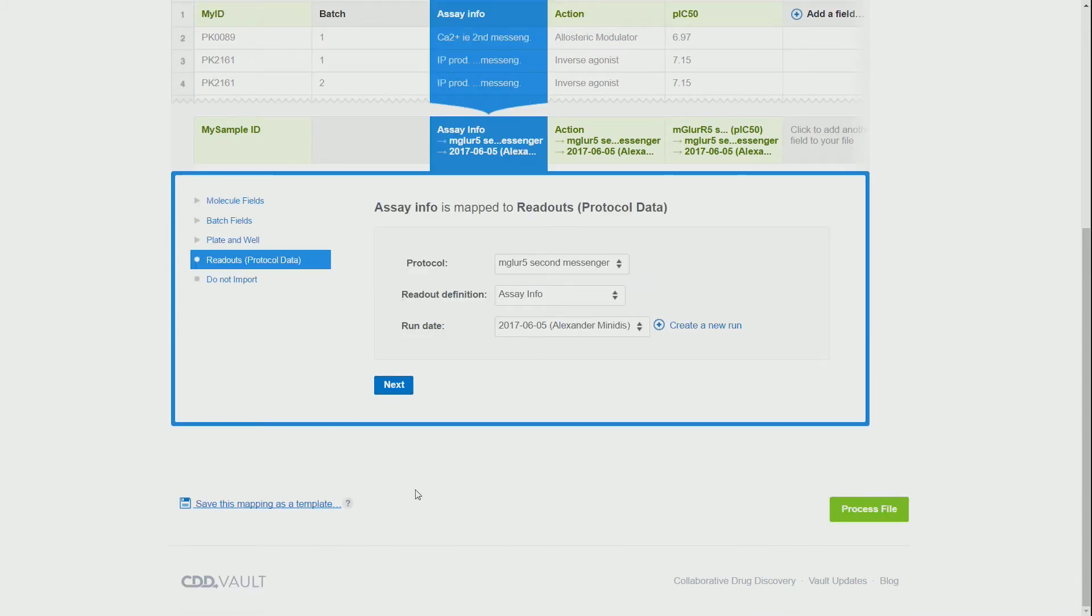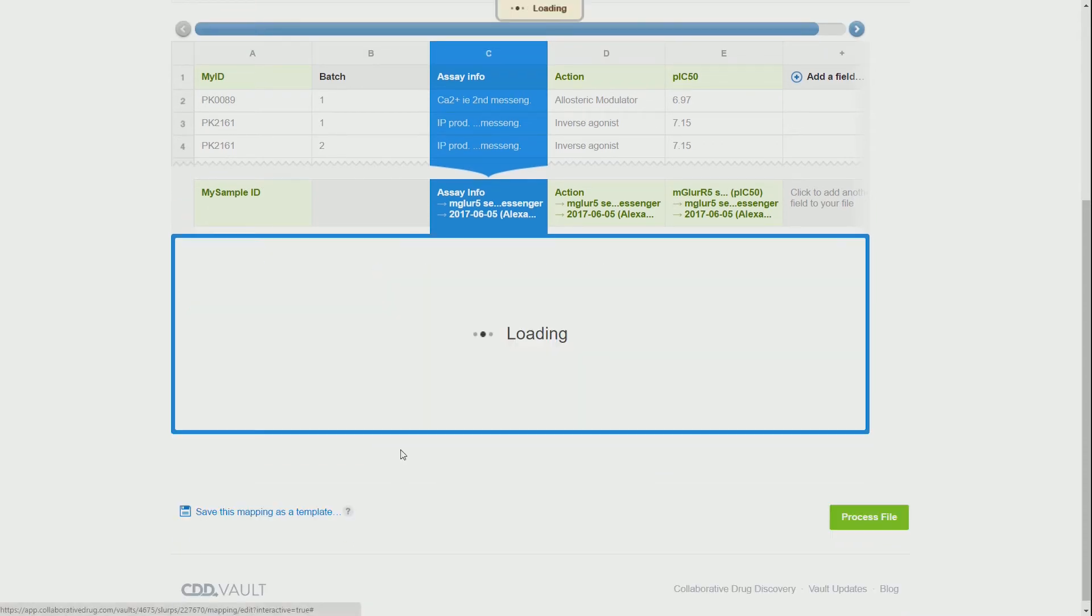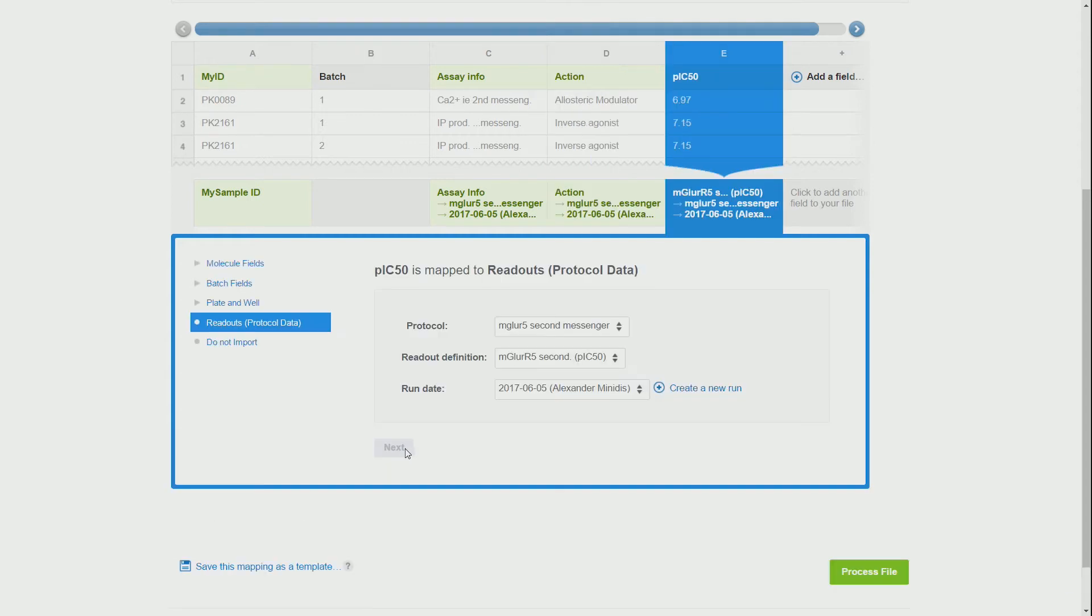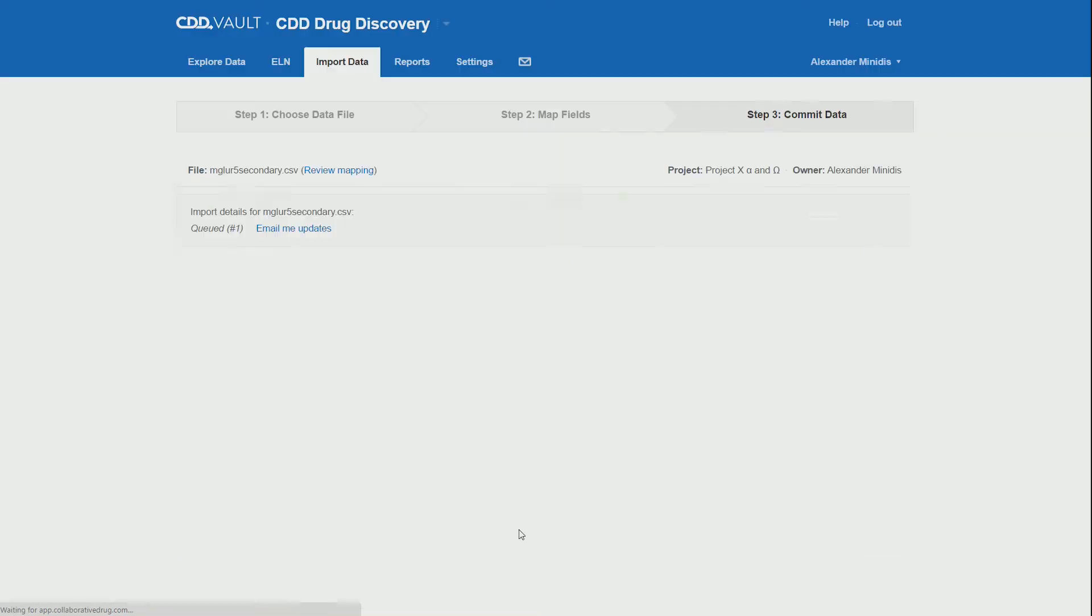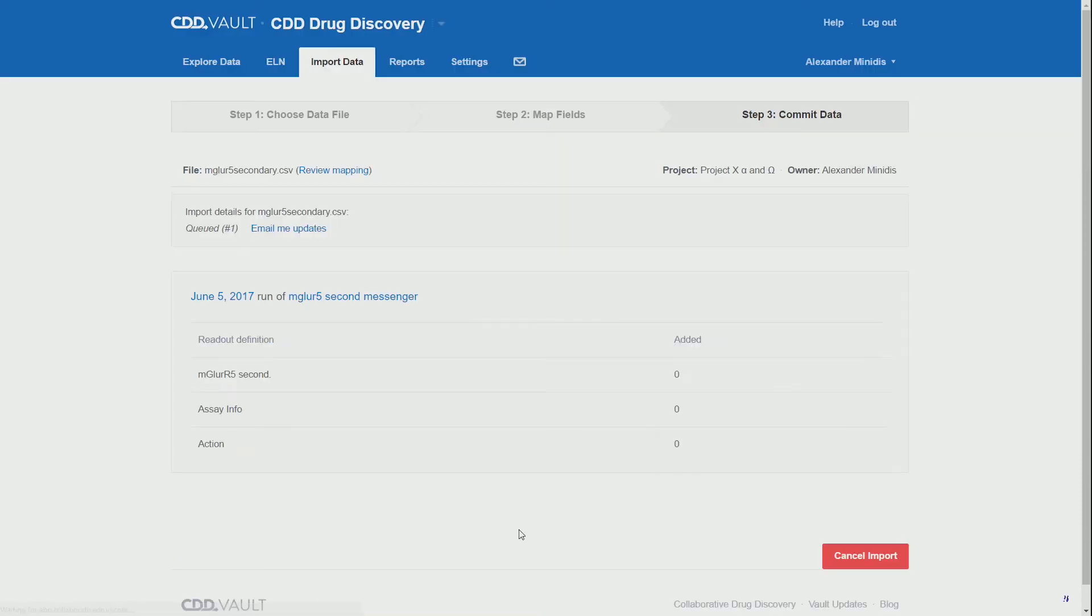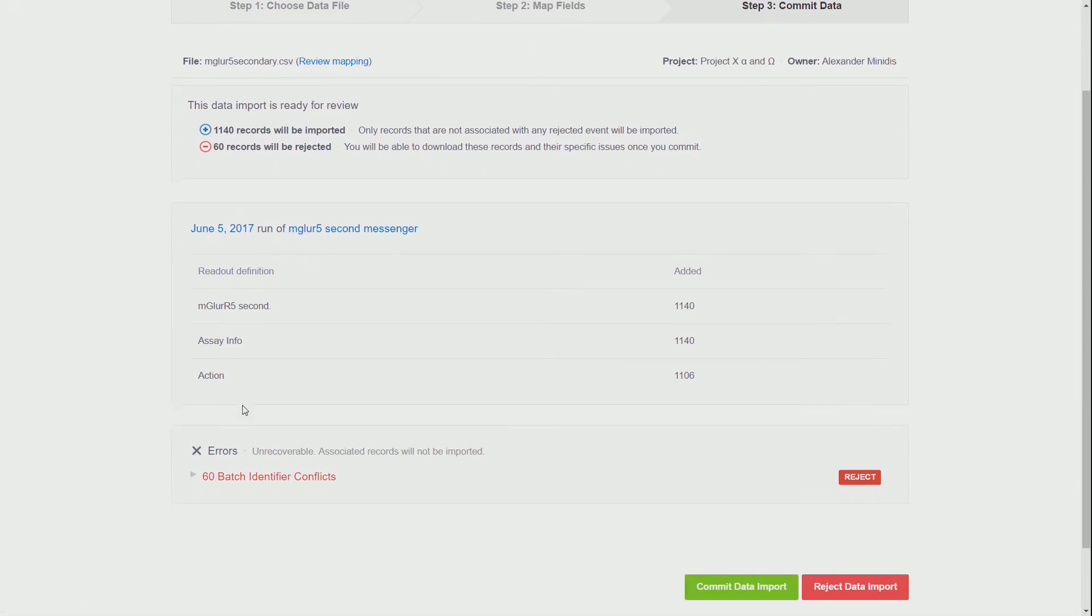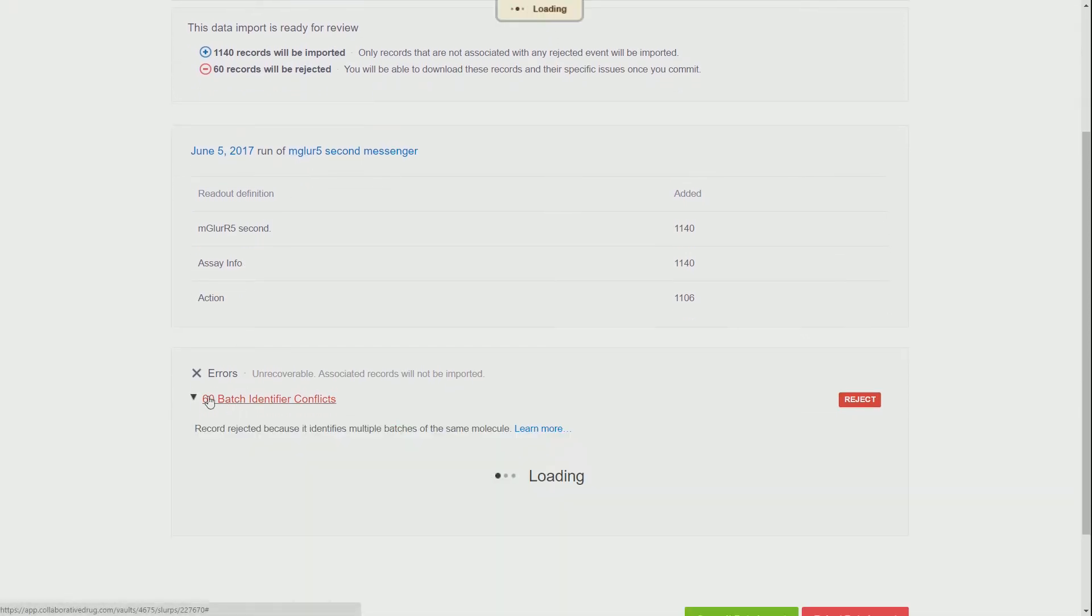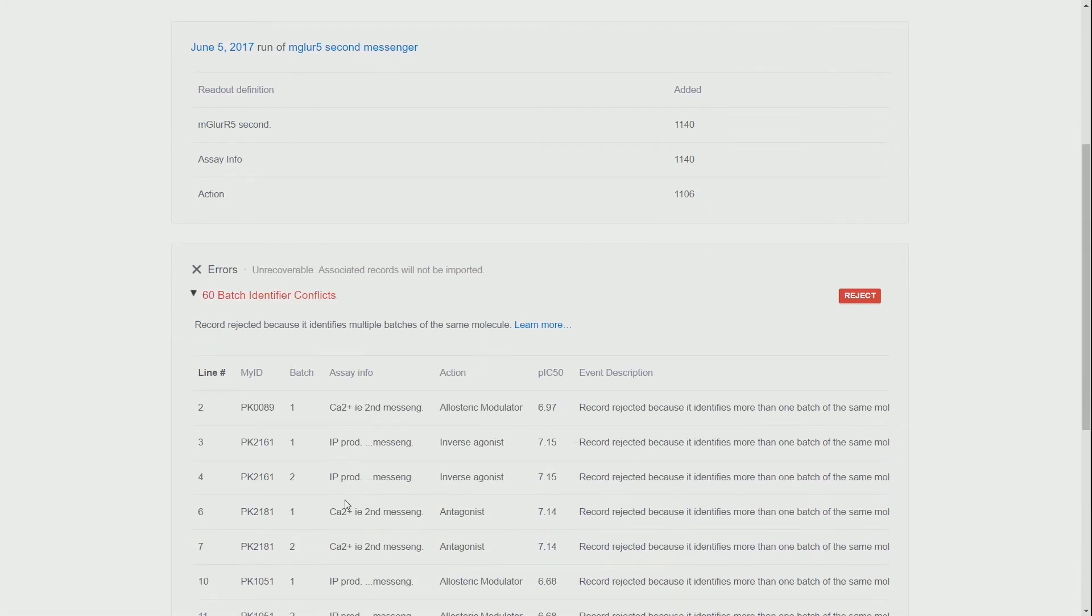But if we recall, we had some duplicate molecules. So most likely the vault IDs, which are the actual molecule IDs that are being used from CDD Vault, will not be the same order or amount as the IDs that you have assigned.